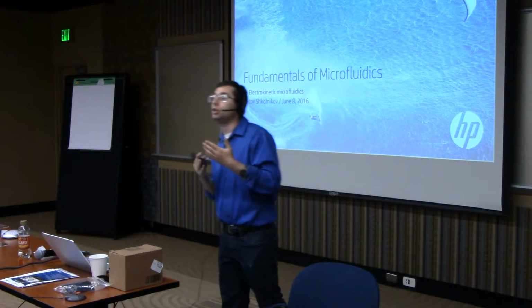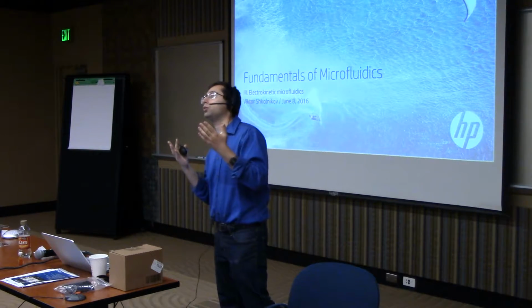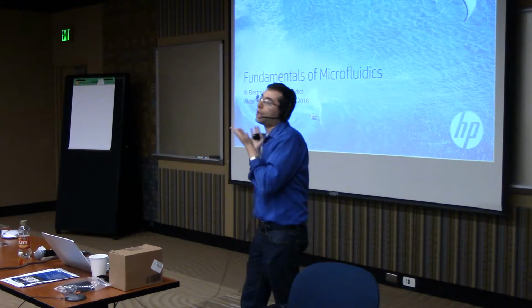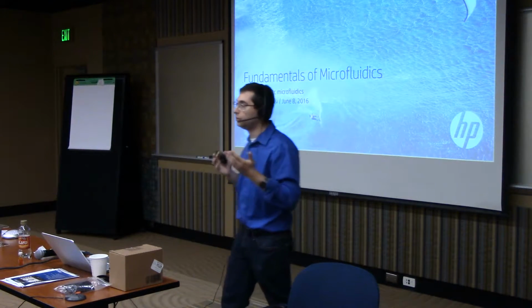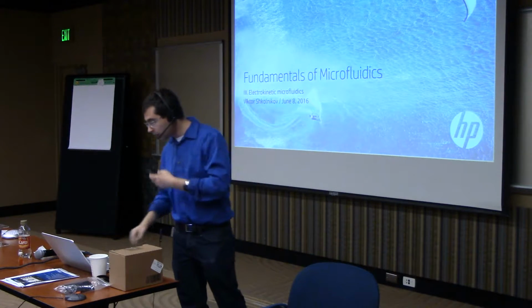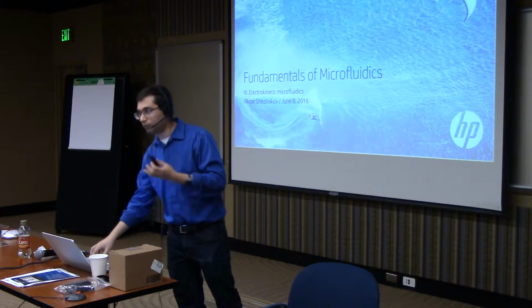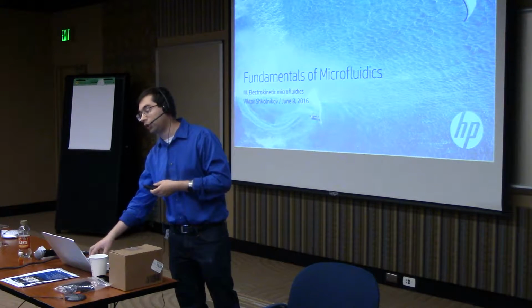But the second reason is that, since HP already does electrically actuated microfluidics, this is pretty much a natural thing for HP devices to do, or one of the natural things. The other things are also very much accessible as well. But today, in the time we have, we'll talk about electrically actuated microfluidics.